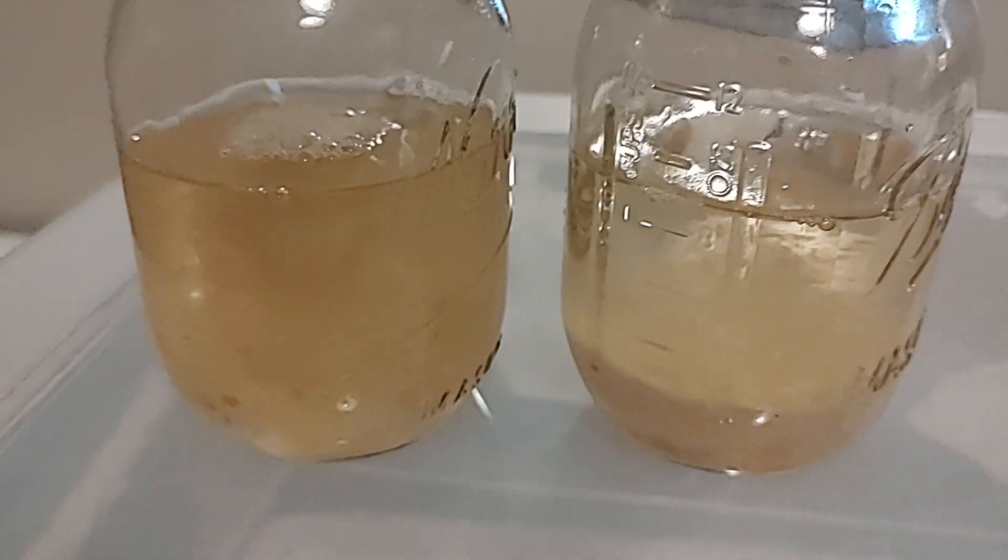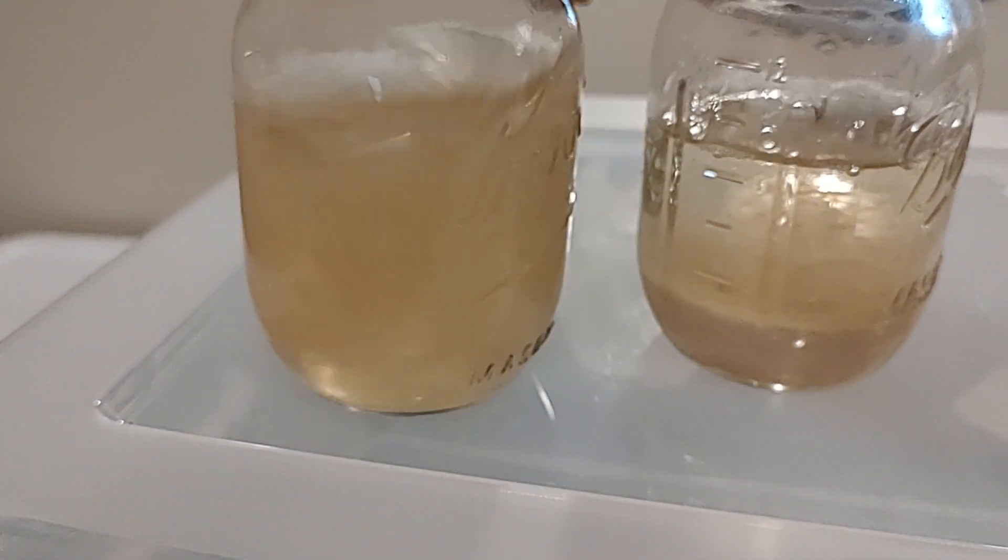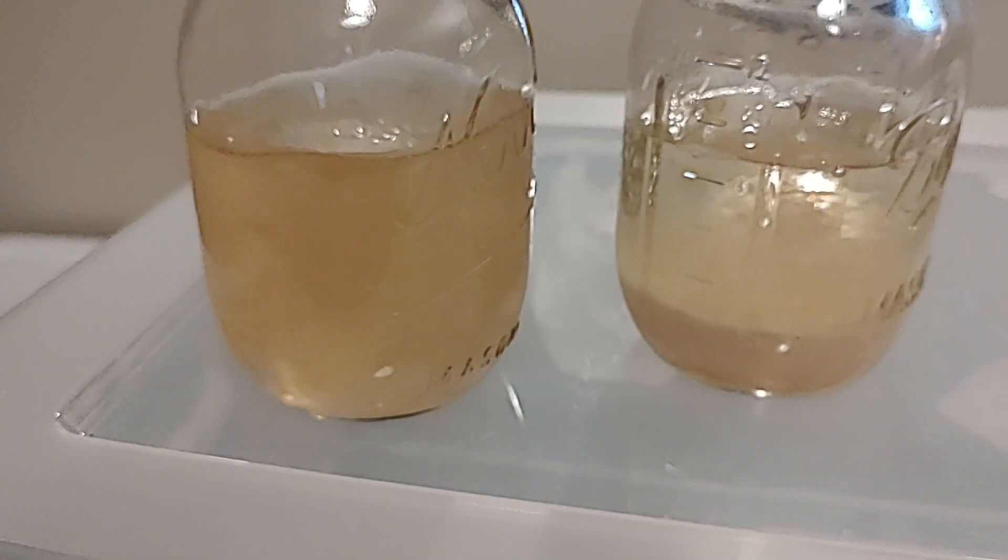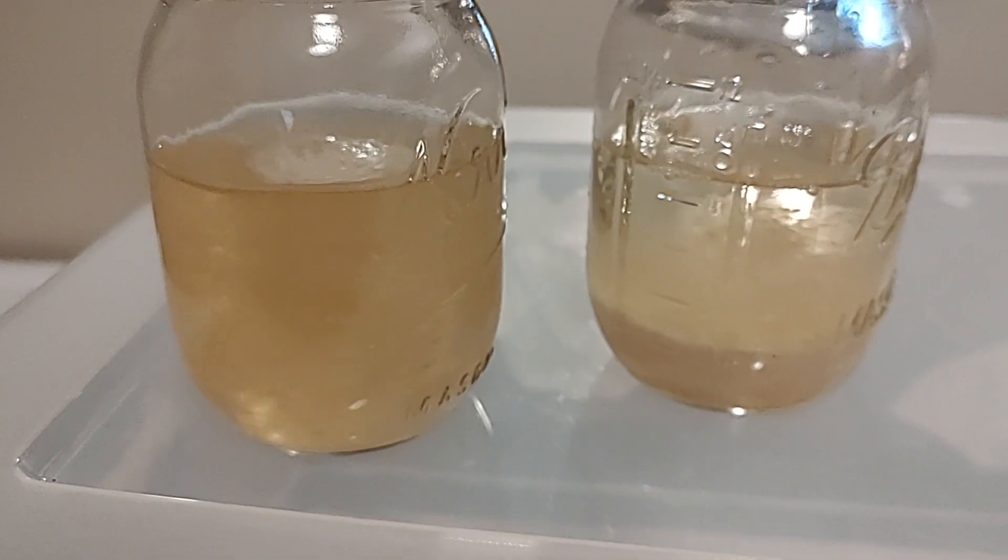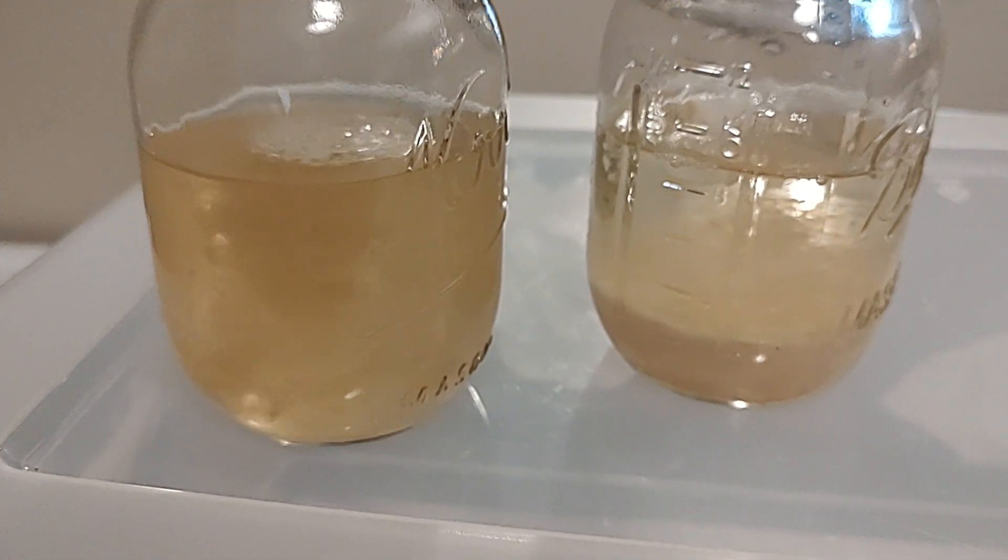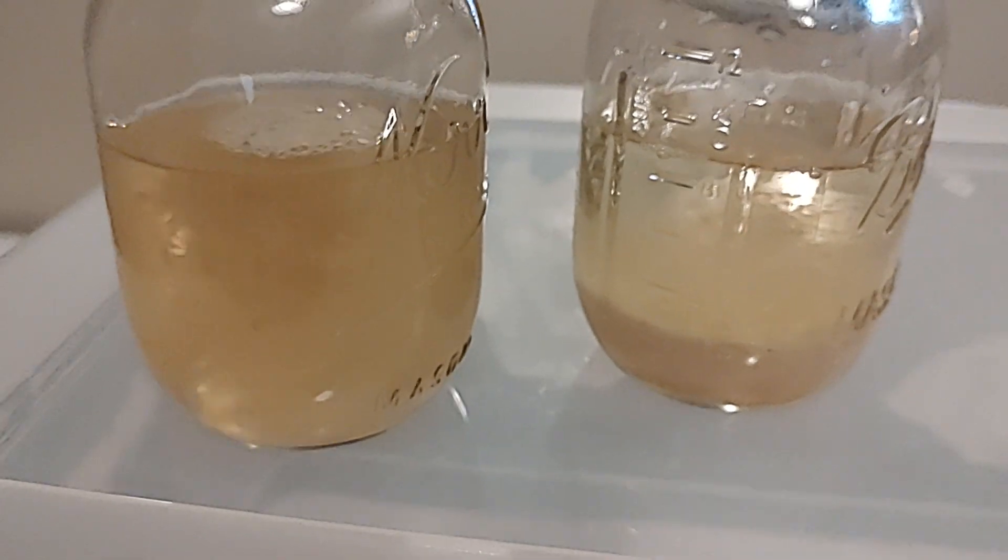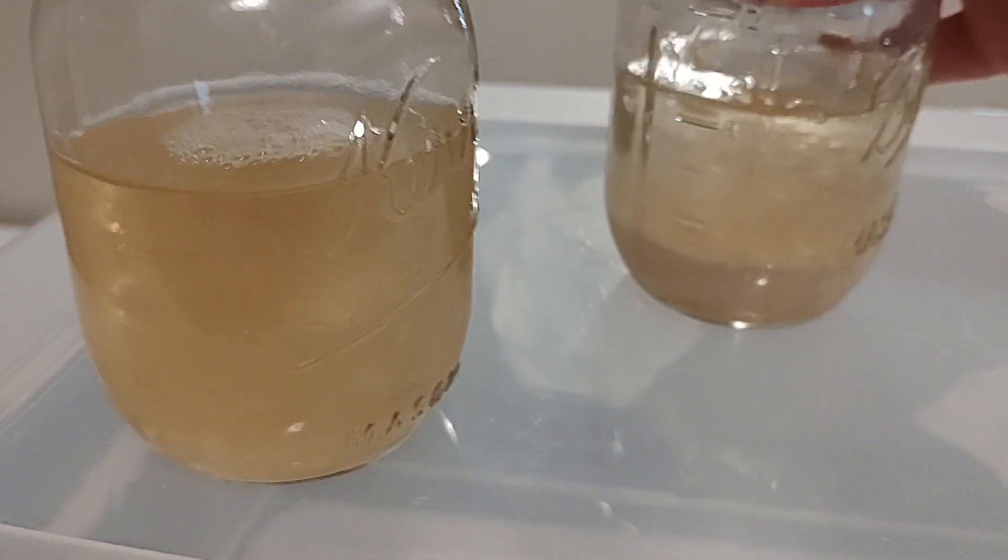A lot of you have talked about putting agar to grain, and we do that. We have videos on that. You can absolutely put your agar transfers to your grain jars, your WBS. However, those agar plates don't last forever. At least we've experienced that they don't last forever.